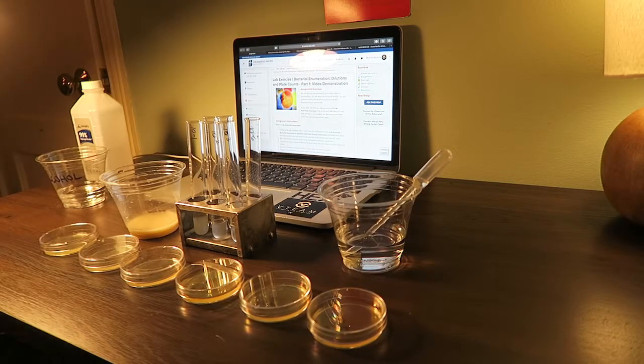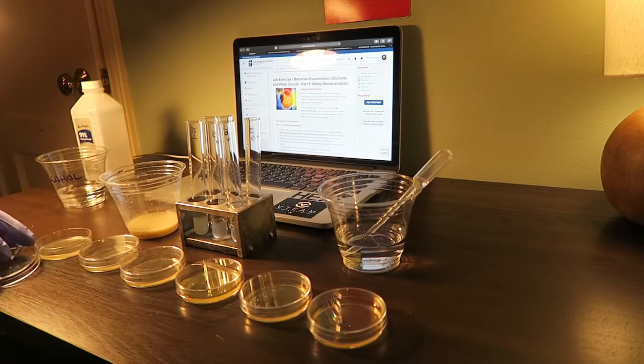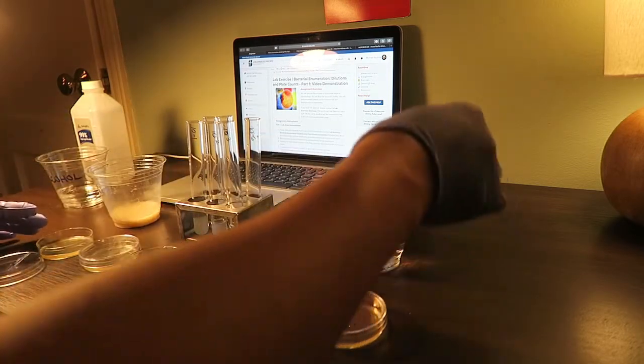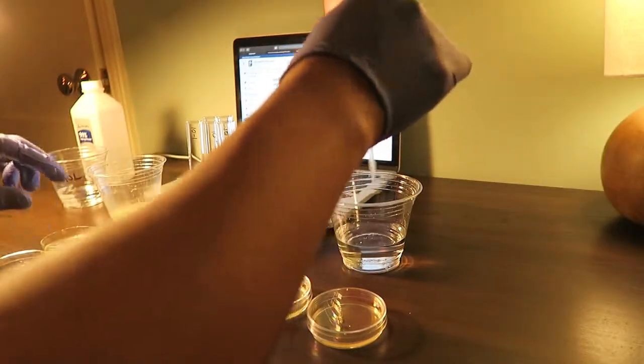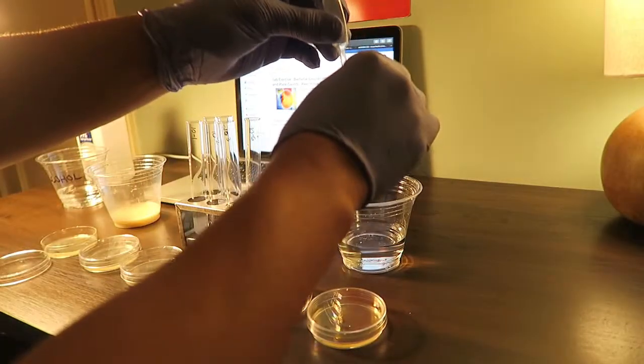All right, now to inoculating the plates. I will now grab the dilutions.